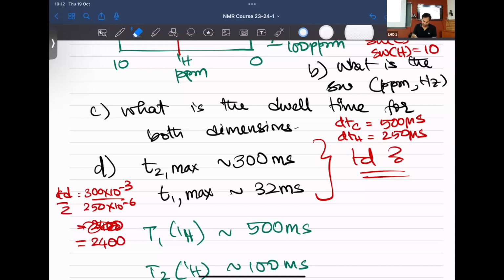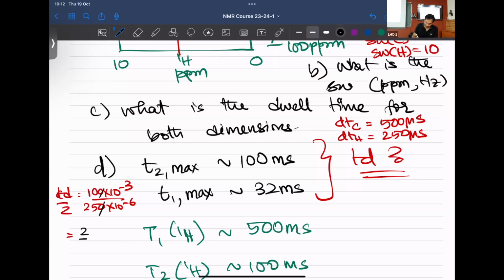Okay, wait a minute. Let me just go back to what I gave you. Okay, so let's say that is what you have. Let me give you the answer because we are taking a little too long for this. Please go and practice 2 by 5, 10 power 3, which is 2000 by 5, which is 400 real points. So the total number of points should be 800, where 400 is imaginary, 400 is real.